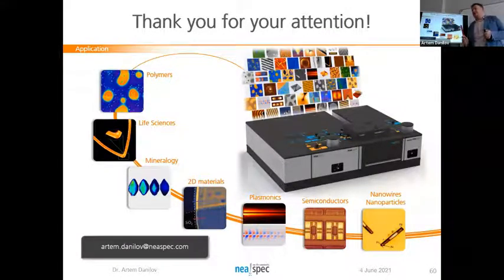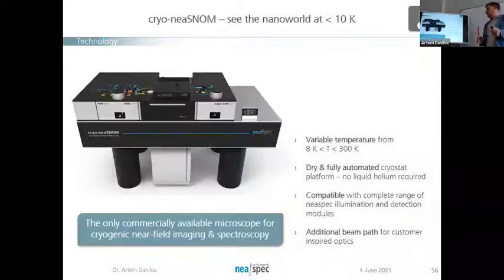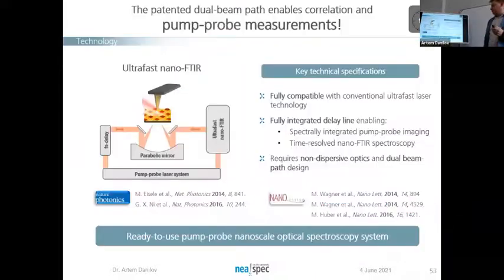Maybe I have one. Regarding the pump-probe setup, I guess there should be some particular ratio between the repetition rates of the lasers. I mean, should it be much more than the oscillation rate of the probe, or what are the requirements? Yes, you're right. The typical frequencies which we're using for pump-probe are in the megahertz range, I believe, and what we're using for tip oscillation is in the kilohertz range. So basically, it's like 100 times difference between them. Basically, we're synchronizing the process so that they're coming at time zero altogether, and then we're using the delay stage, some mechanism, to postpone one pulse compared to the other one. So the repetition rate should be around megahertz. Yeah.